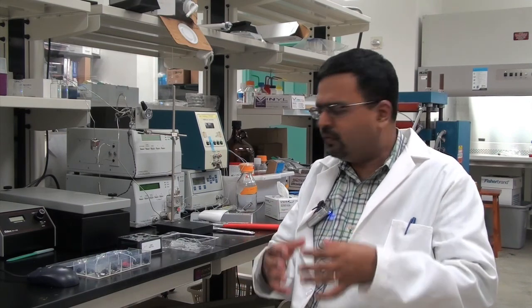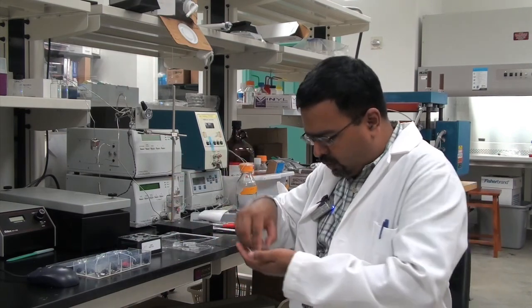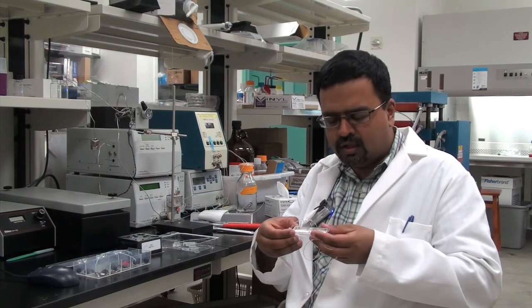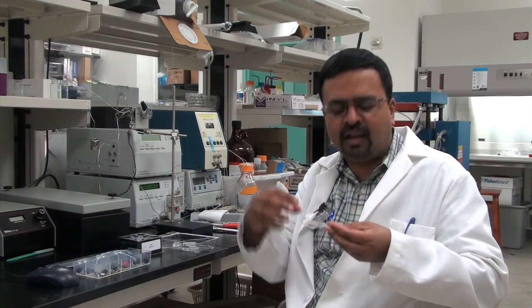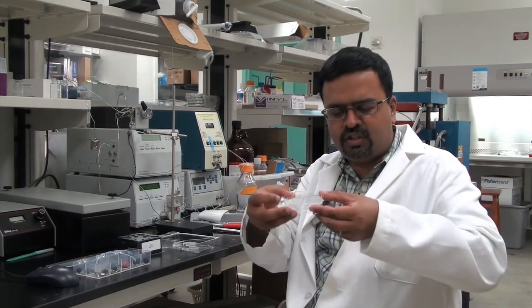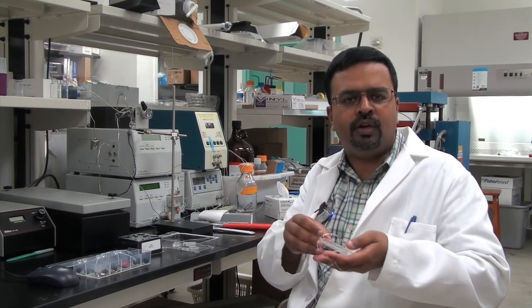The way we do it is we take an approach where we said if the environment is so complex, can we recreate that environment, that complexity in a micro format in the lab? So we bring in this whole concept of microfluidics or lab on a chip where we take a small chip and then we recreate the environment so that we can actually simulate the gastrointestinal tract in a small chip which is the size of a glass slide.